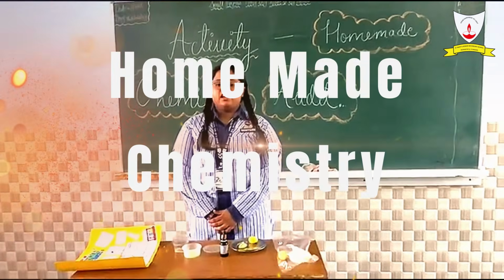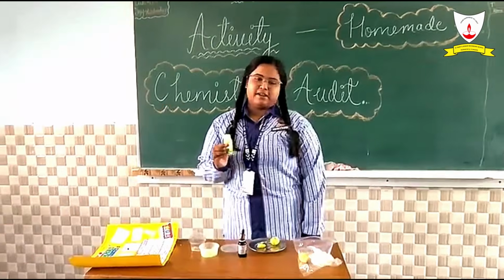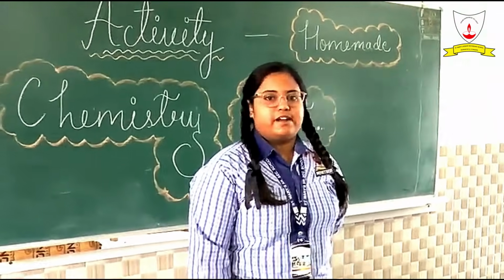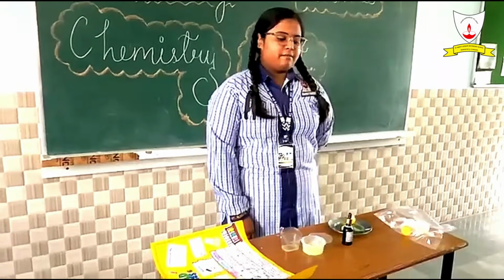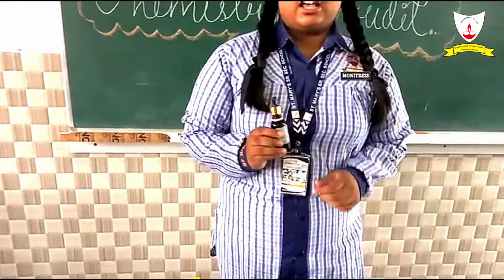Good morning everyone. We all know that lemons are acidic and Eno is basic. But instead of just asking you to believe it, I will prove it with the help of a live experiment. So the solution that you see in my hand right now is a natural indicator.